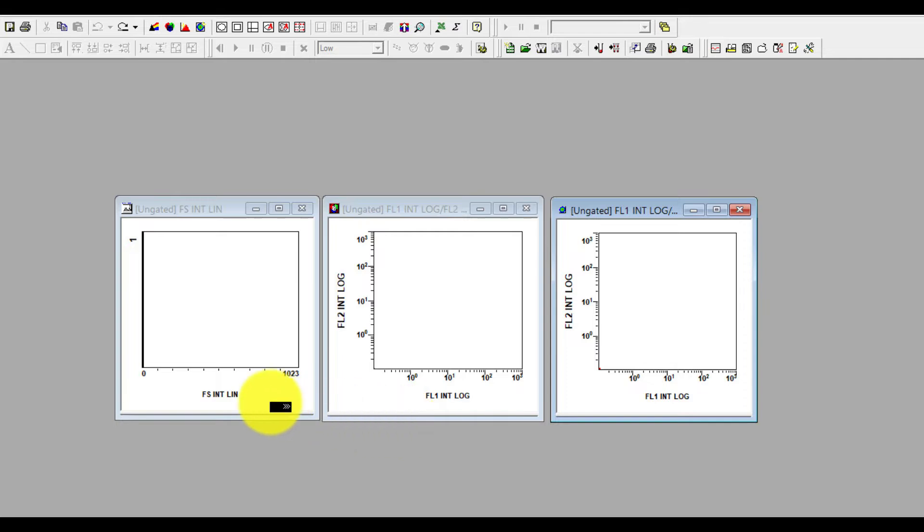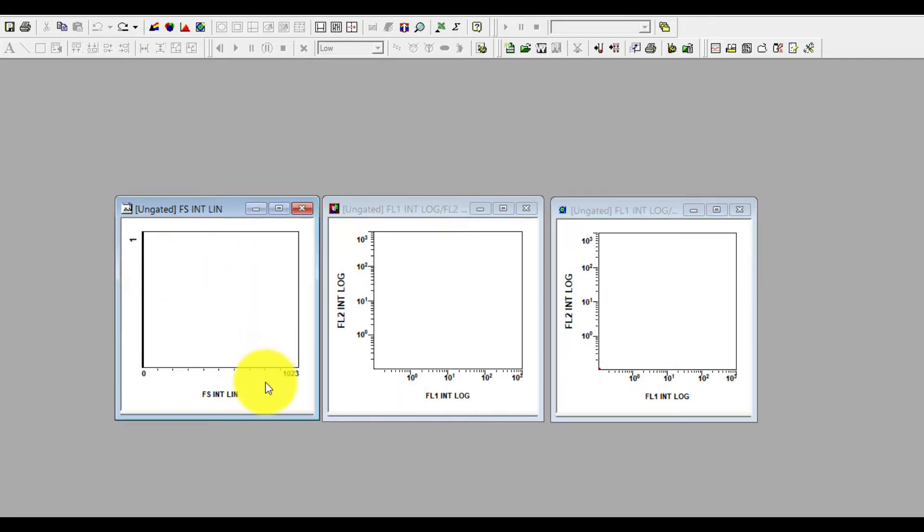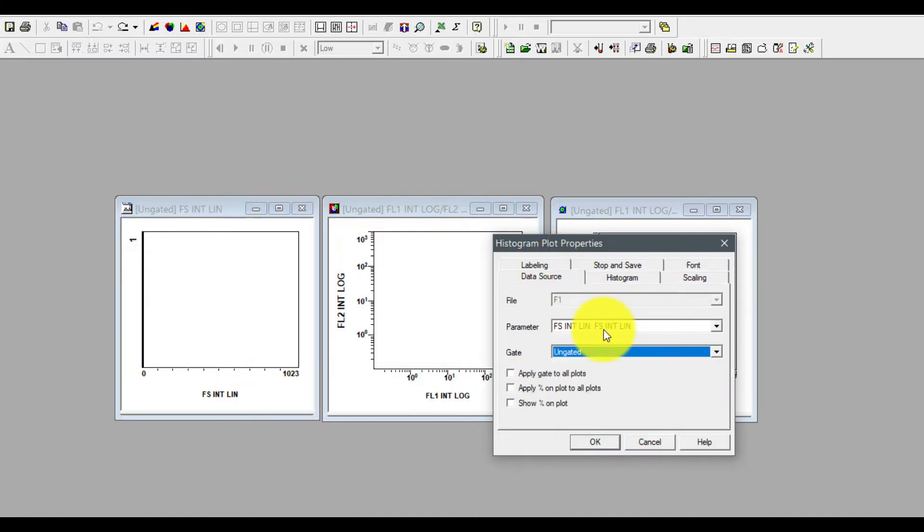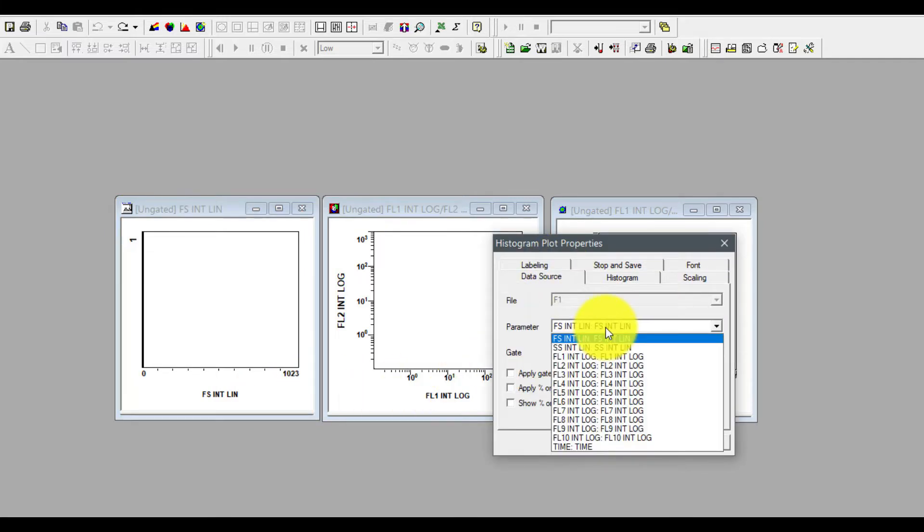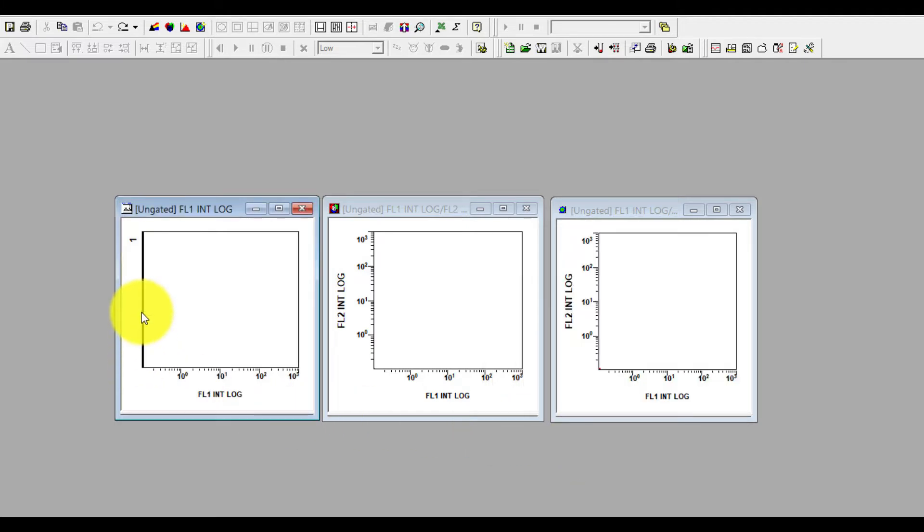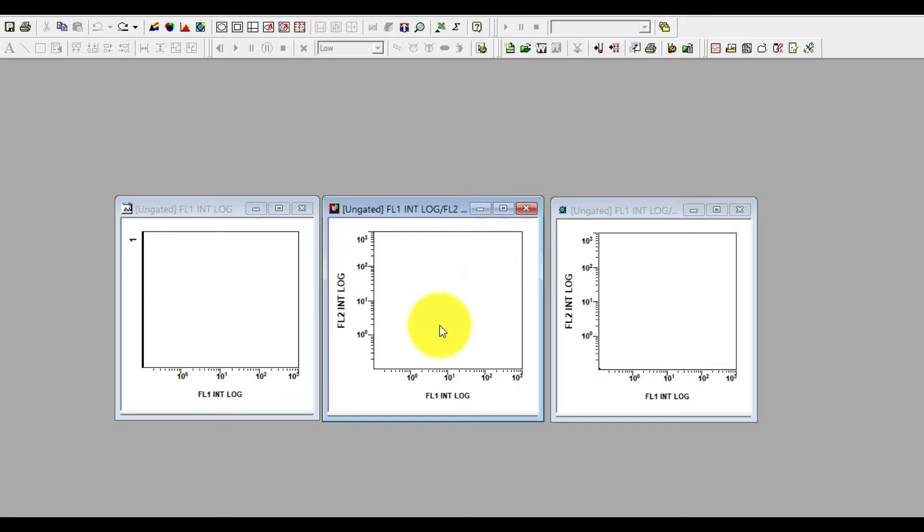Now go to the histogram and also change it to log scale. Go to data source, click the parameter option, click FL1 and press OK. So now all your three plots have log scales. In the log scale you can make the quadrant.